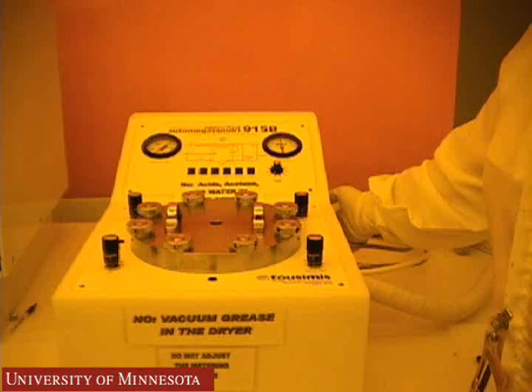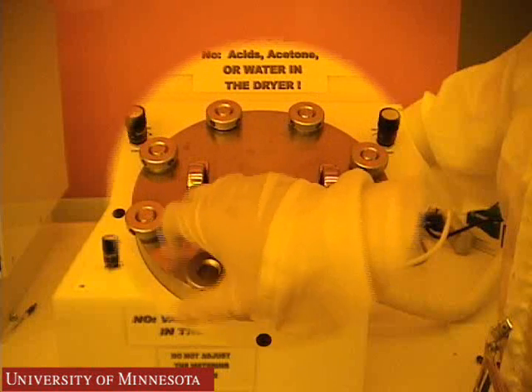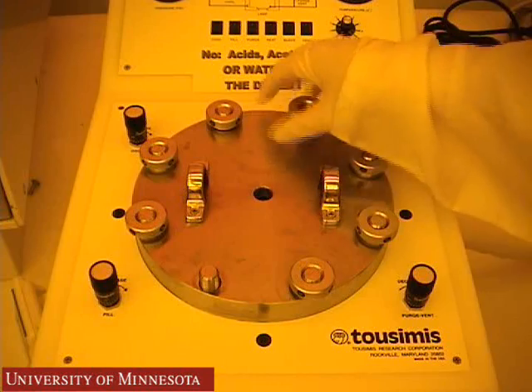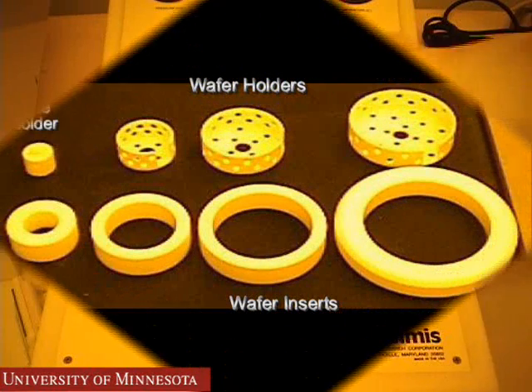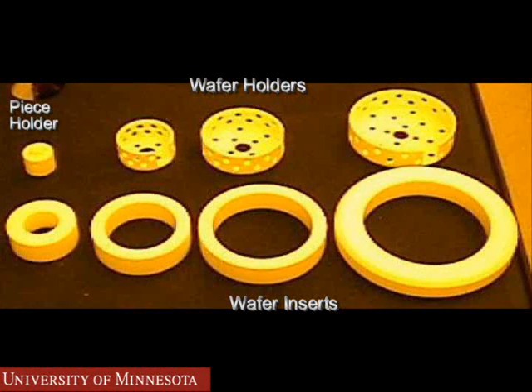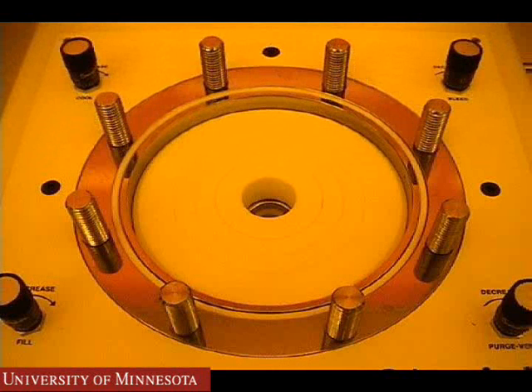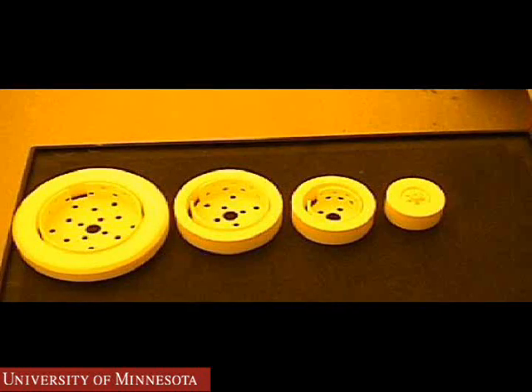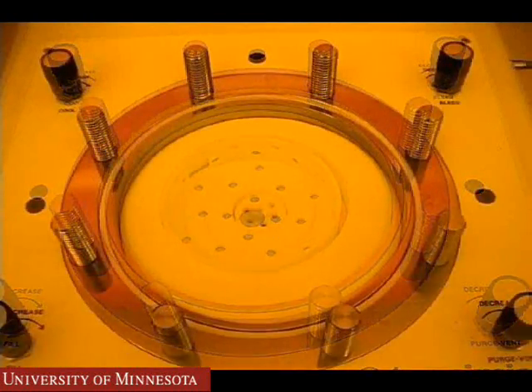To turn on the machine, go to the right side and flip the power switch to on. Push the vent button — it should start blinking. Loosen the nuts on the lid in a star pattern: loosen one nut, then the opposite nut. Carefully lift the lid off the chamber and place it to the right of the machine. The chamber can fit anywhere from a six-inch wafer to a one-centimeter square piece using the correct insert. The inserts reduce the size of the chamber volume to minimize the amount of solvent needed for the run. The holder holds the wafer or piece in place. Each holder can hold multiple wafers using the spacers provided with the system. The piece holder also can accommodate several pieces at a time.